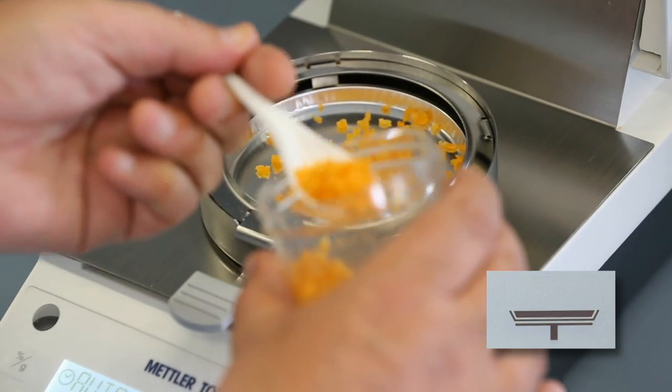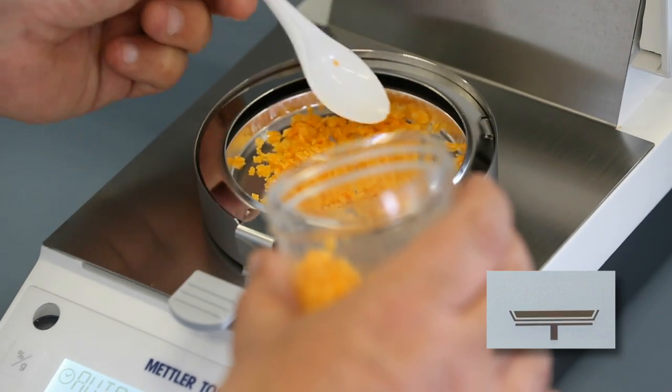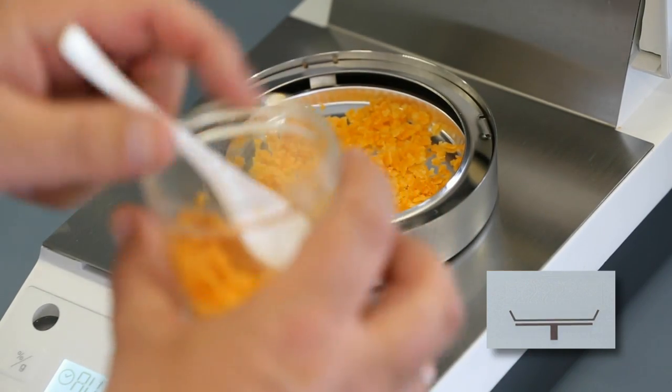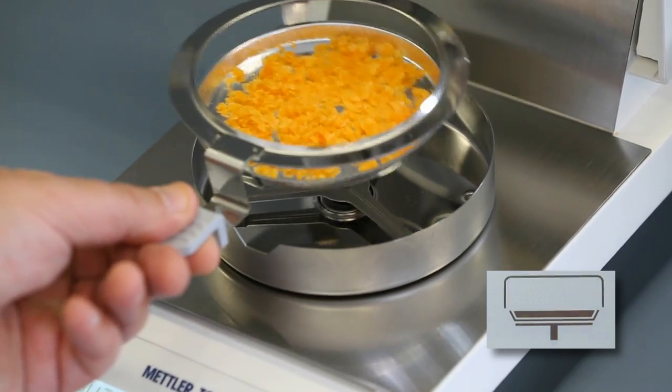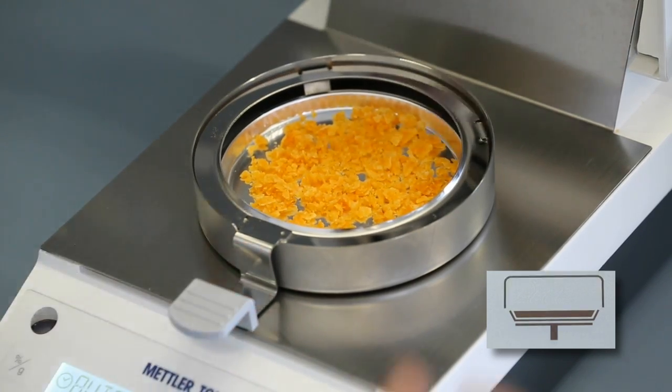Typically you would weigh in 3–5 grams of sample, as I'm doing now, but the amount weighed in really does depend on the type of sample you're measuring. You have to make sure that the sample is evenly spread around the aluminium sample pan.